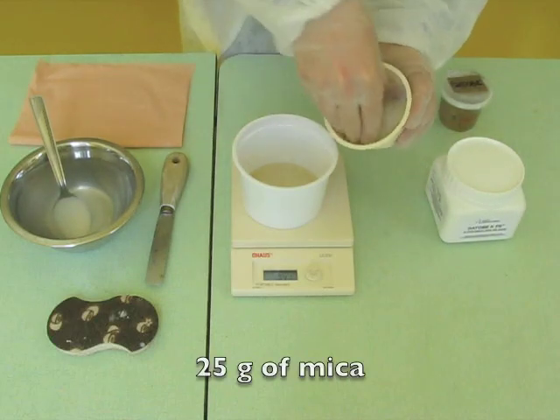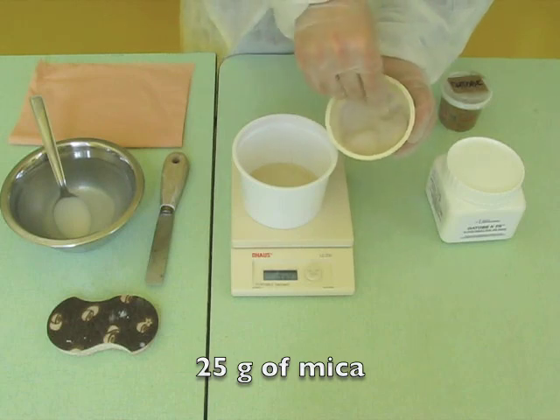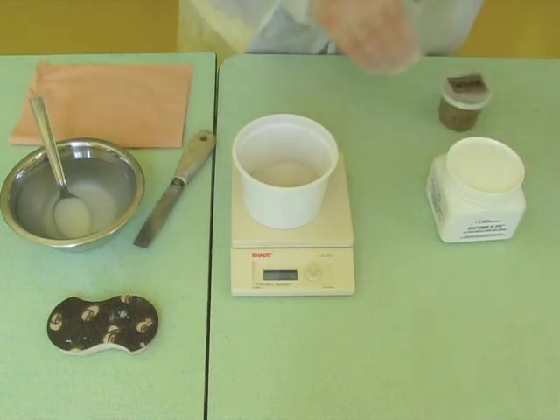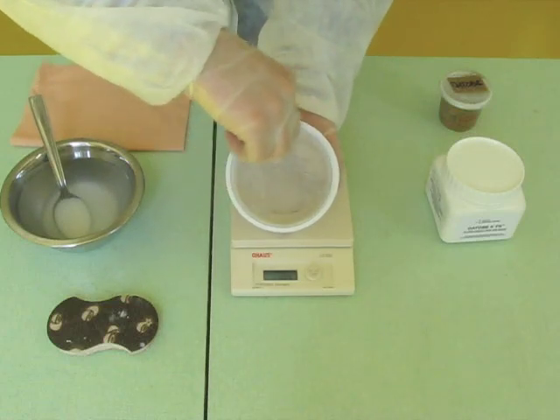We prepared 25 grams of fillers. Here we use mica. We pour the fillers into the binder and mix the whole.